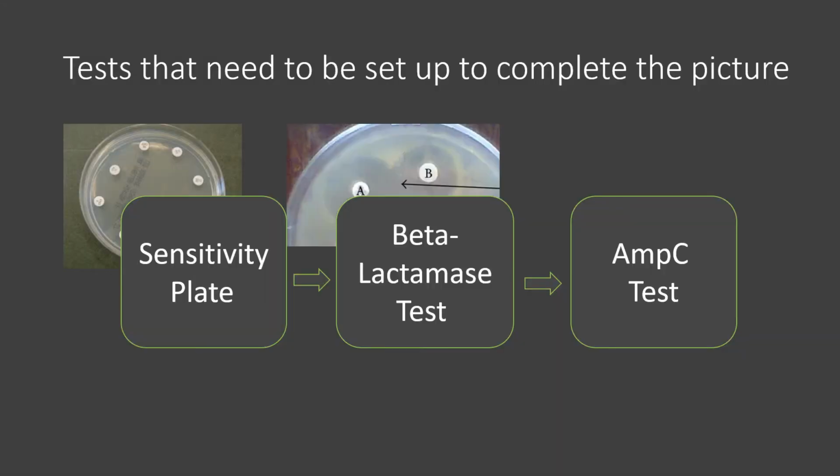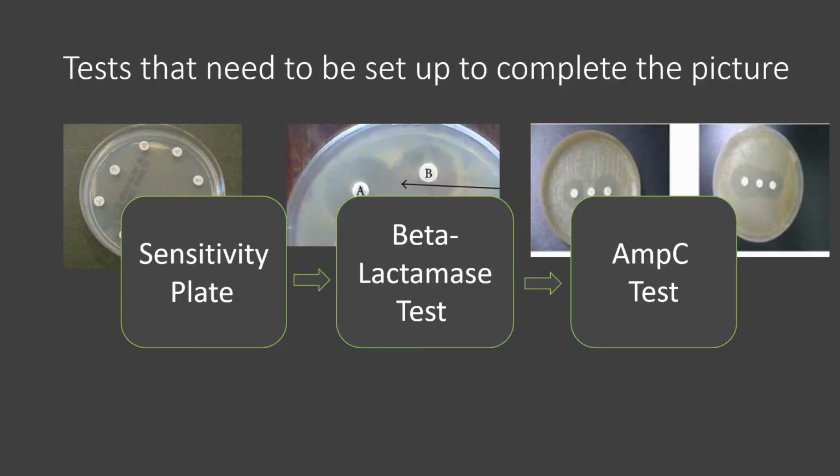Both E. coli as well as B. fragilis are normal gut flora, but due to the abdominal surgery they found their way into the blood. In order to allow the doctor to have as much information as possible for a course of treatment, we will need to set up antibiotic sensitivity plates. That way, the doctor will have the information needed to make an accurate decision on what antibiotic treatment will be best suited to the patient.